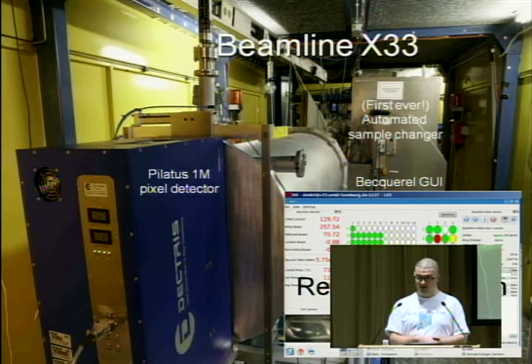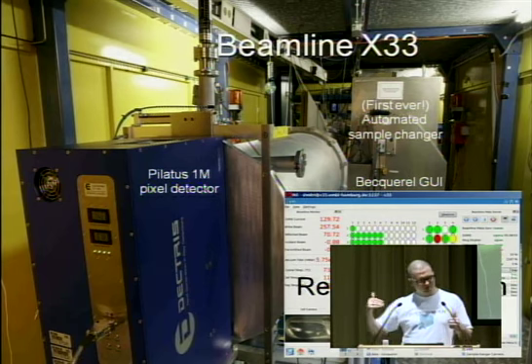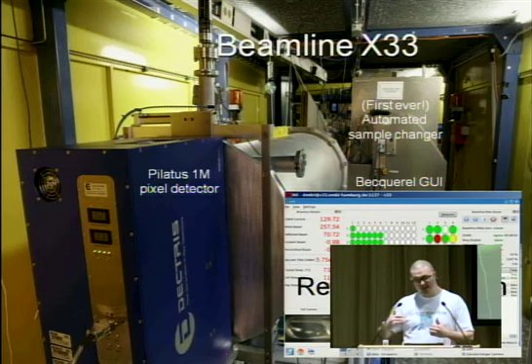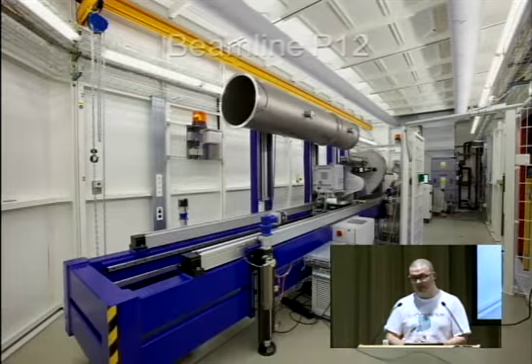And this made it possible to make the measurement process like a remote operation. So you can actually sit here in Taipei and control the beamline in Hamburg. You can even do it now. If we had more time, I could try to connect there, but it's late at night there, so I guess we wouldn't see much going on. But anyway, you can actually send your samples and then control the measurement process from home.